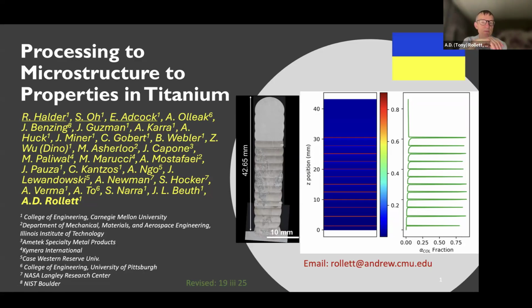And so the two pictures that you see, this rather strange looking object here is a part, and you see the dimensions. It's Ti-6-4. It's been deposited by wire directed energy deposition, specifically a laser hot wire system. Even in this very low magnification optical set of images, you can see the vague outline of the beta grain structure. You can also see the scalloped edges, so each scallop is one bead that's been deposited.